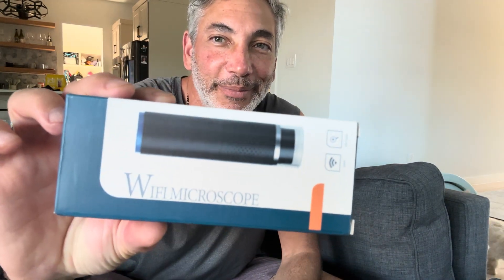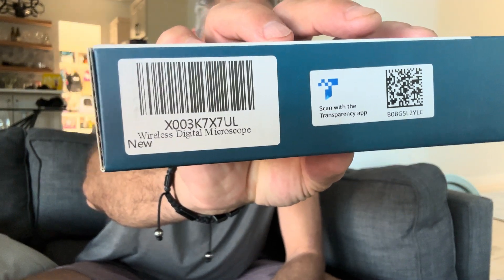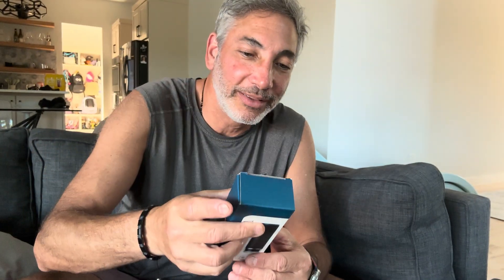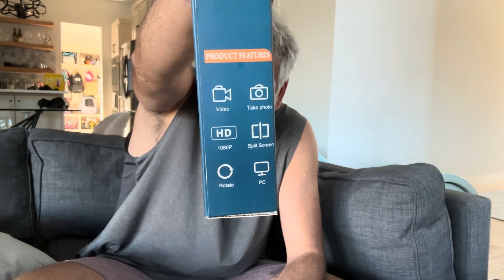Hey everybody, it's Neil and yes I am a geek — I got myself this Wi-Fi microscope so we're gonna give this thing a try and see how it works. I don't know what brand it is; this is all the information on it.